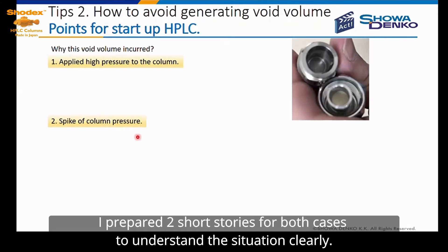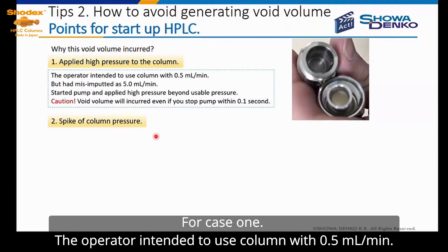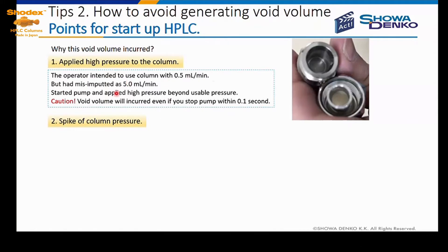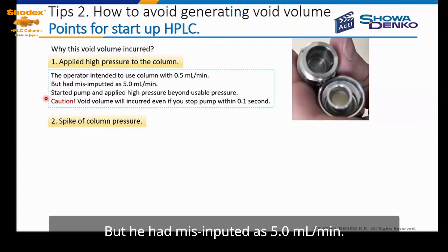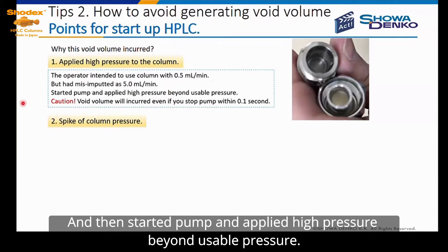I prepared two short stories for both cases to understand the situation clearly. For case 1, the operator intended to use the column at 0.5 ml per minute, but missed the input and set it at 5.0 ml per minute. He then started the pump and applied high pressure beyond the usable pressure.